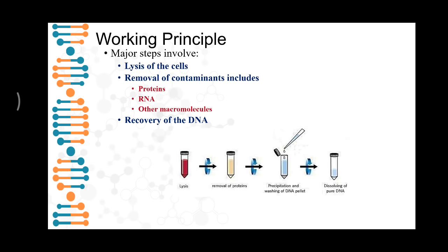Basically, in DNA isolation, there are three major steps involved. The first and foremost is lysis of the cell. We have to break open the cells.